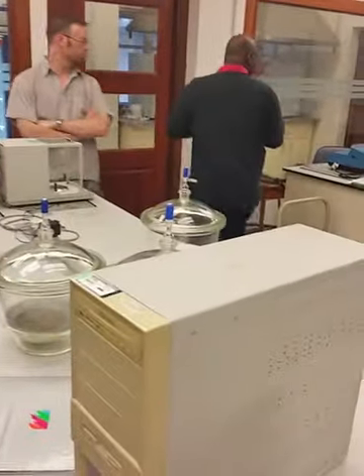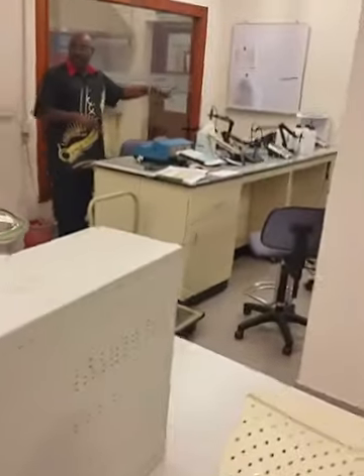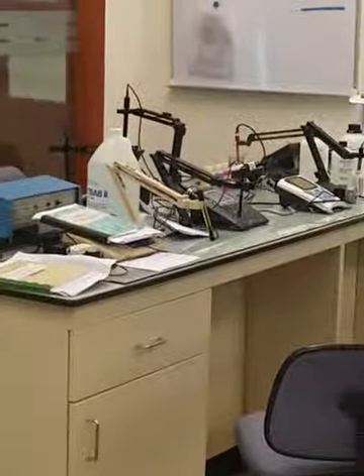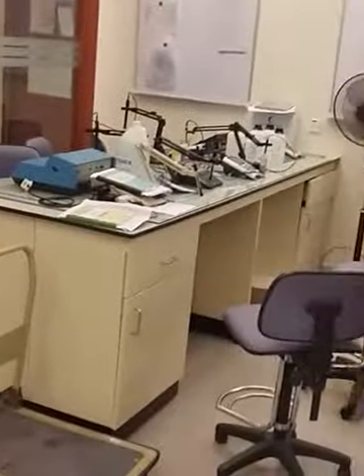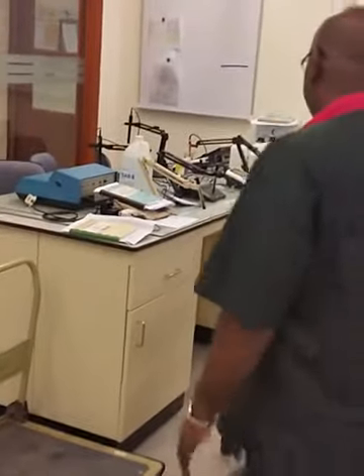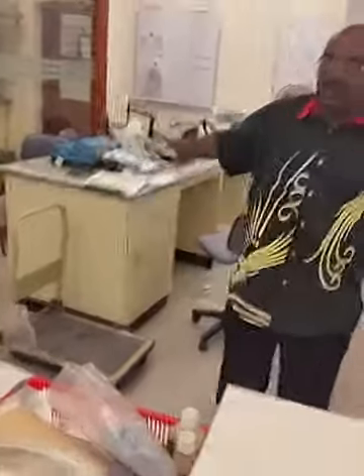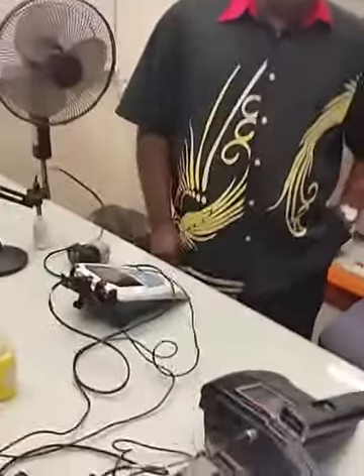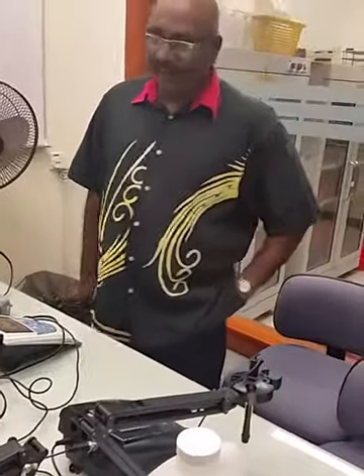These are the pH meters where we measure the pH. For fluoride, you can use this pH meter with an ISE electrode. Take photos here. This one is prepared. We always buy from the company. The chemical compound they won't let us know. It's a secret recipe. This one we can prepare.